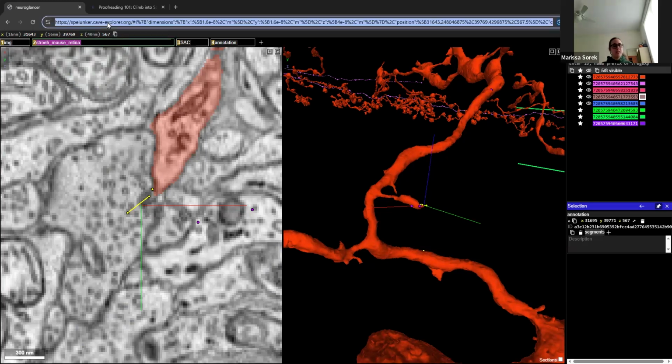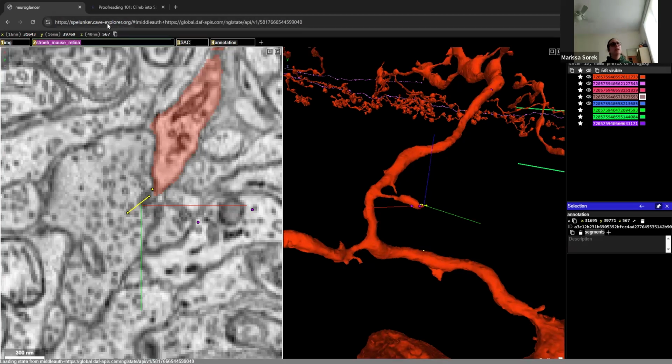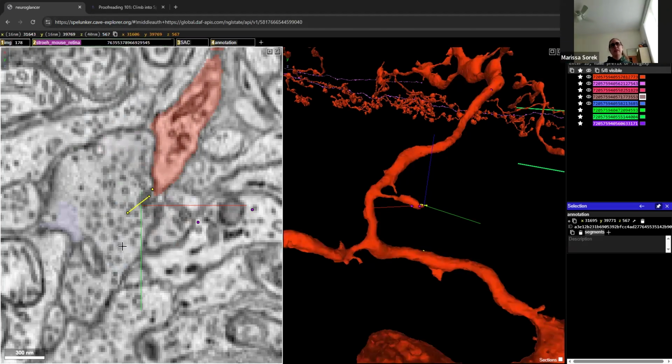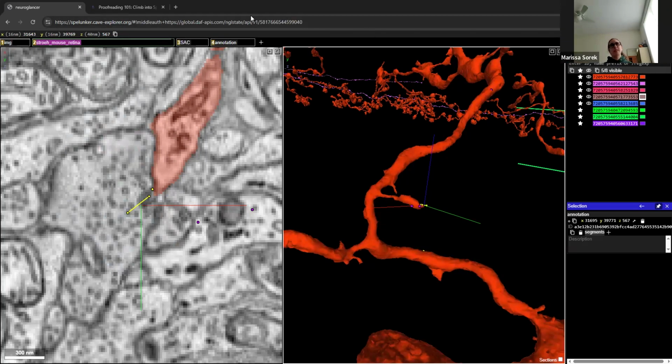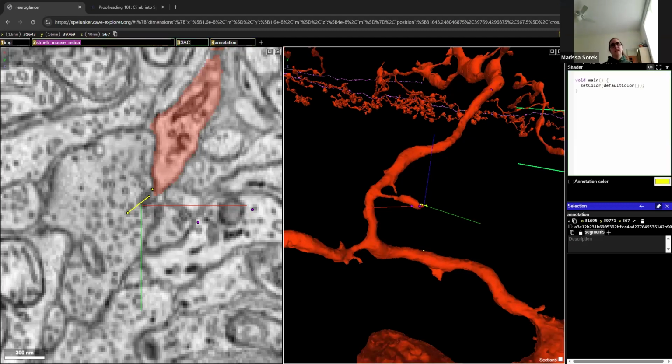And if I were to paste that right into my URL here, it's going to reproduce the view. I just did a quick refresh, but it will bring it right back up exactly where I left off in my view, all my segment IDs here, and it's going to keep any of my annotation tabs that I've created here. And all the data that you've entered into those annotation tabs, the annotation list, right? Yes, exactly.